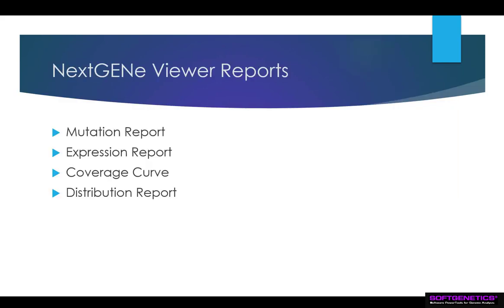Several reports are available. We'll cover the features and settings for the Mutation Report, Expression Report, Coverage Curve, and Distribution Report.